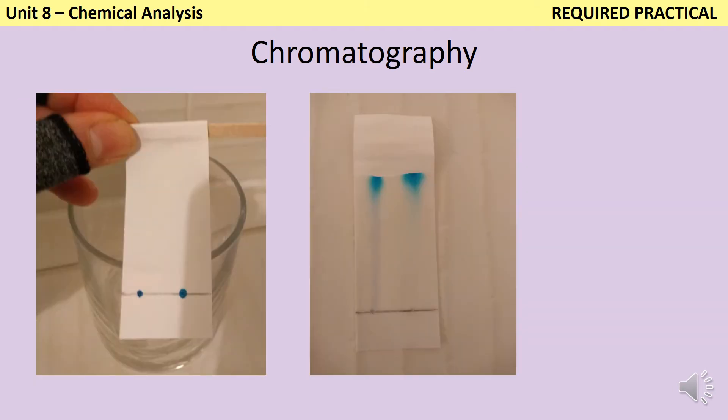So you can see here I have the start line drawn in pencil. I have one standard to compare my sample to. I'm using a splint to stop the chromatography paper from falling down into the solvent, and then finally on the right-hand side you can see the finished chromatogram.